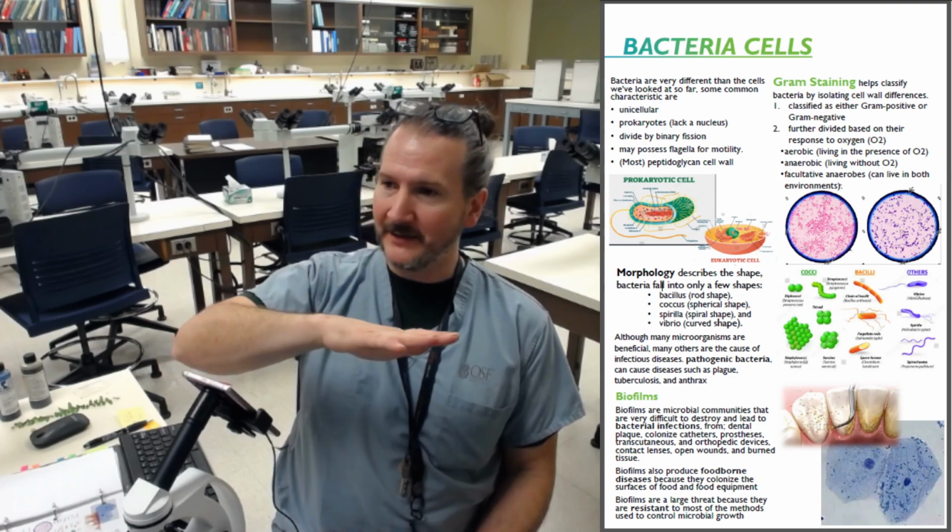One important thing to know about bacteria is that it can form something called a biofilm. And biofilms are like little cities of bacteria is the way you could think of it. So a biofilm is when something starts developing into a sheet across the surface and it's just packed with lots and lots of bacteria. It's the biofilm, or the bacteria that made that biofilm. It's almost like it made this little city, and it's really strong. It's harder to kill when it's in a city.